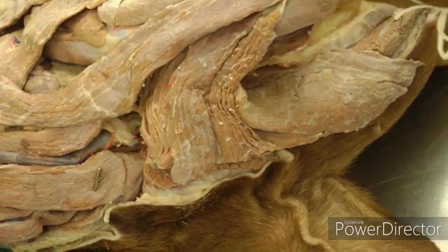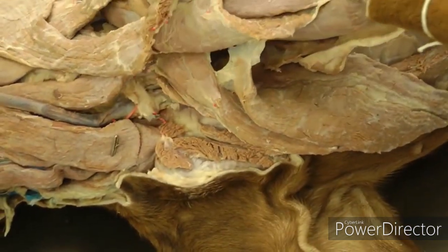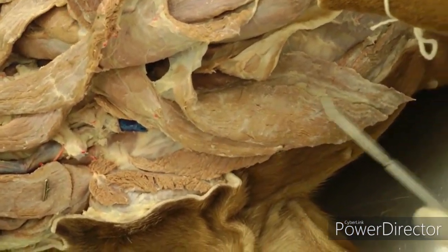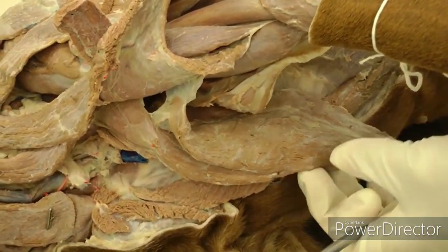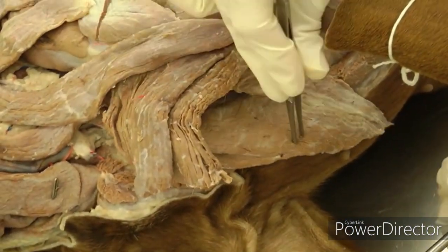Then look at the deep pectorals. Reflecting the superficial pectorals, you can see the deep pectorals underneath — they've also been cut for today's lab. This is the deep pectoral running down to the belly. After you isolate those, make a cut similar to the superficial and reflect the deep pectorals as well. Superficial pectorals here, deep pectorals here.